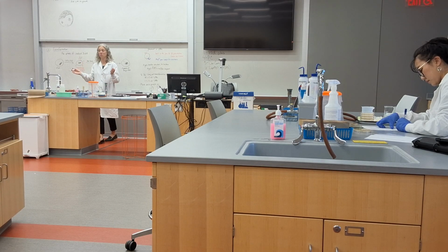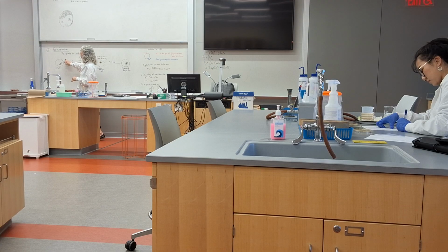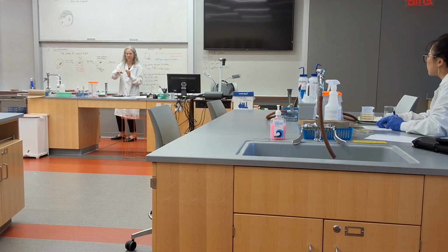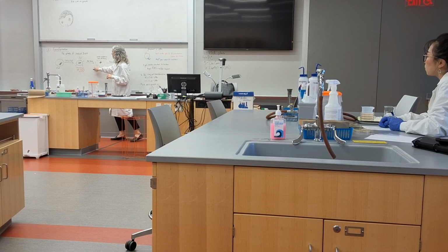If two things are neutral, they can mix just fine. Okay? So the use of calcium chloride, we're using it to make it really cold, but also we're utilizing those positively charged calcium ions to coat the negatively charged DNA, the negatively charged membrane, so that they will get in close proximity to each other.